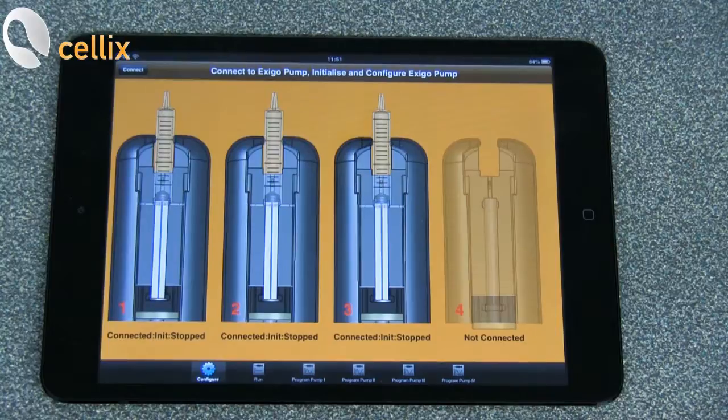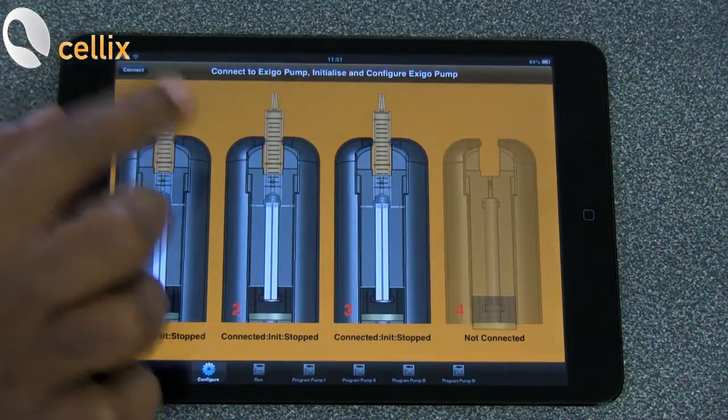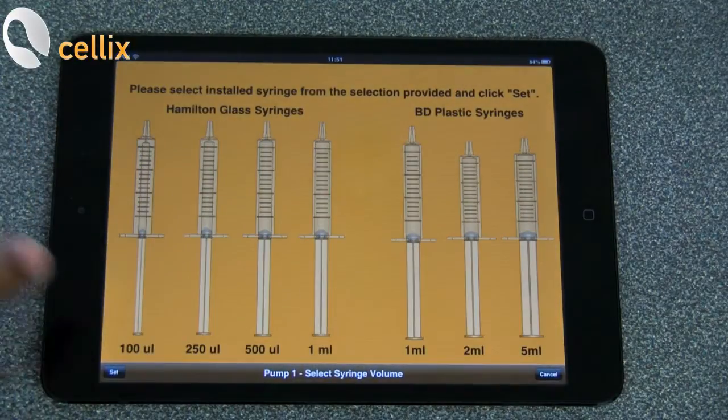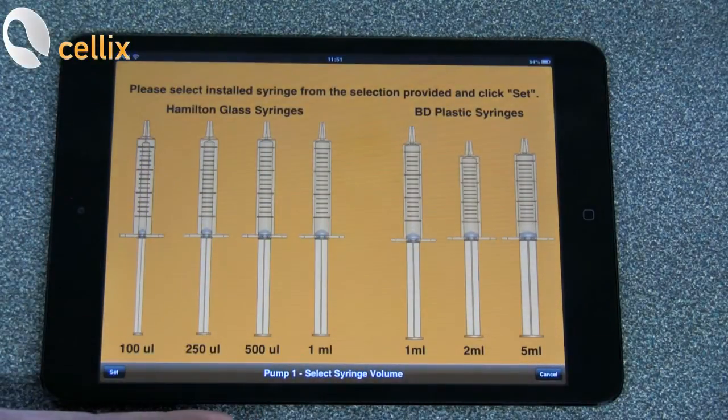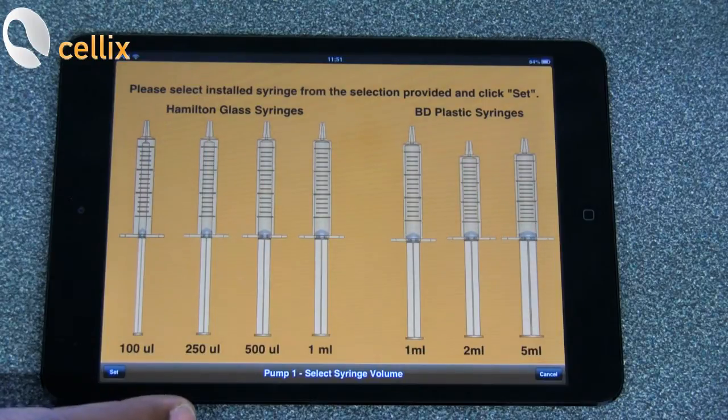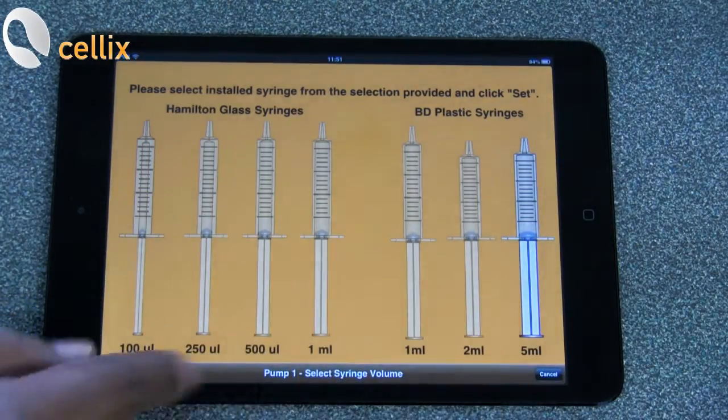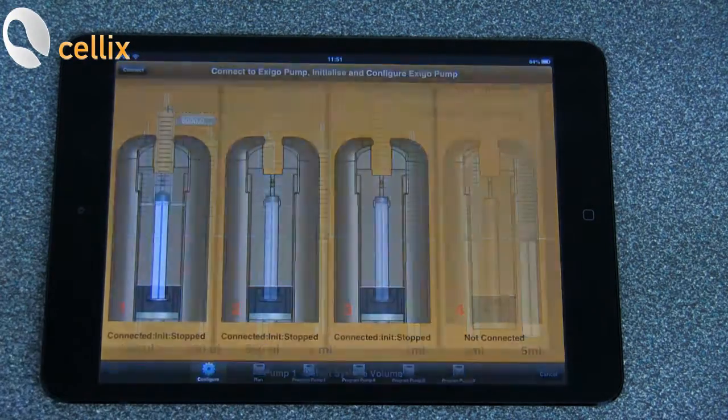The next step is to select the syringe. To select the syringe, you double tap on the syringe and it displays various syringes. Here, we are going to use a 5 ml plastic syringe. So click the 5 ml syringe, click set.